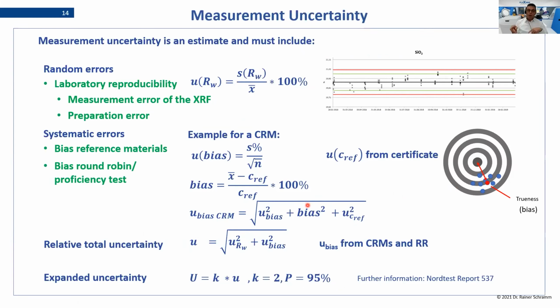If you go the other way around, that for example you base your uncertainty calculation only on the RMS or SEE of your calibration, then there is a risk that you are too good, that you haven't included all the error, which is only shown in the calibration and not in the laboratory.